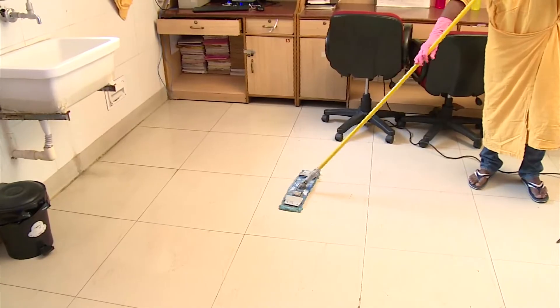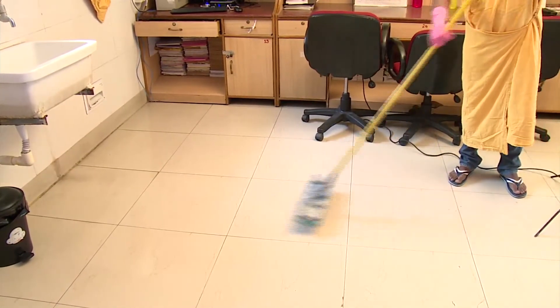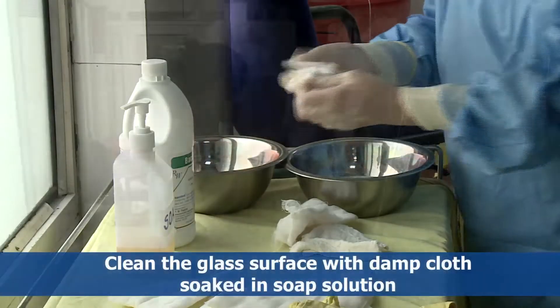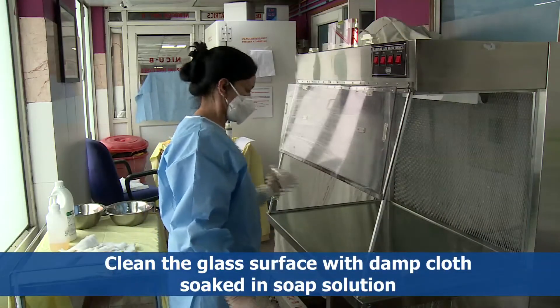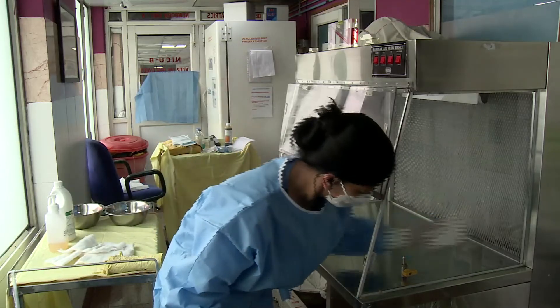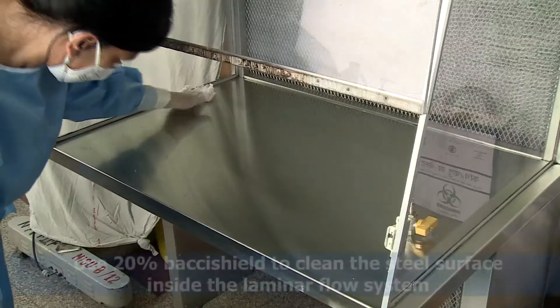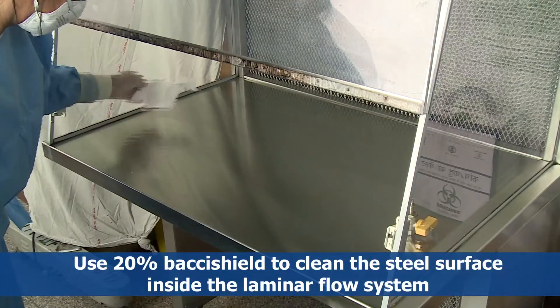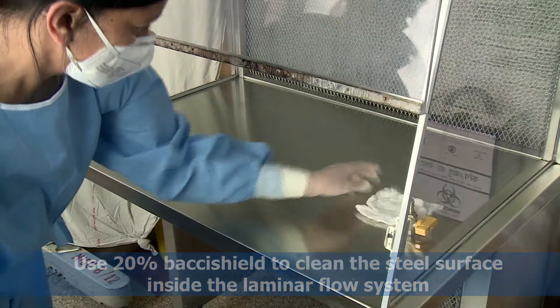Use laminar flow after cleaning and dusting the room. Clean the glass surface with a damp cloth soaked in soap solution, and use 20% Basi Shield to clean the steel surface inside the laminar flow system in each shift.